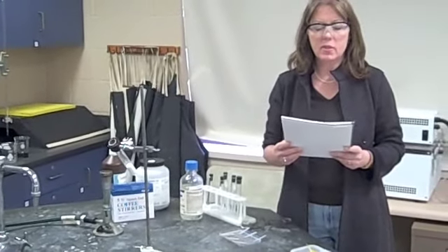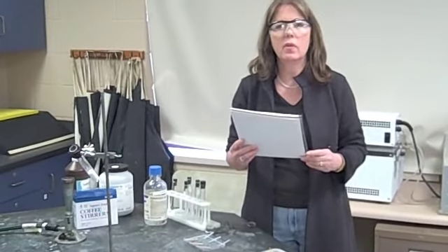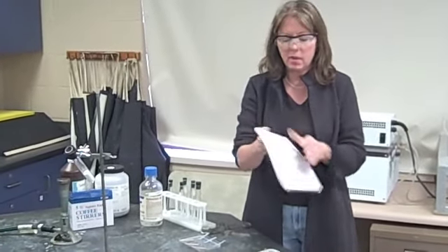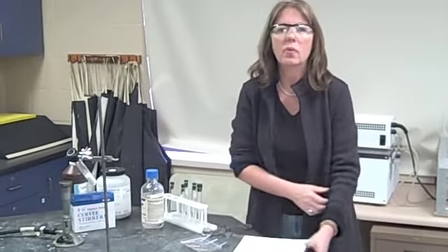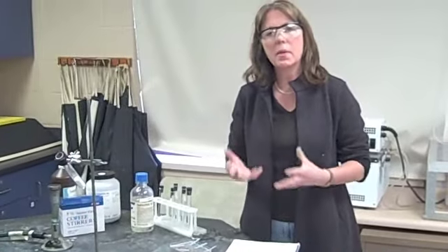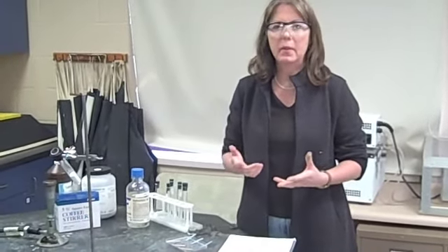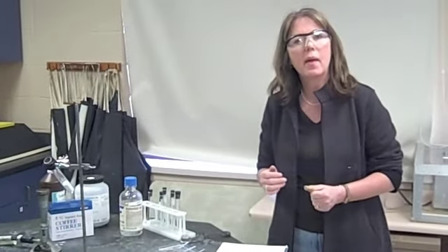Hi, I'm Janice Crowley from Wichita Collegiate School. Mr. Trumbull and I are here today to show you a few of the lab techniques that you will be needing for your general reactions lab experiment on pages 43 through 47. We're not going to go through all the procedures with you. You definitely need to read this over, but we're going to go over some of the points that you see in your worksheet that you wouldn't normally be able to answer unless you watch this video, and there are techniques that are better seen than reading about them. So that's why we're doing this pre-lab for you today.